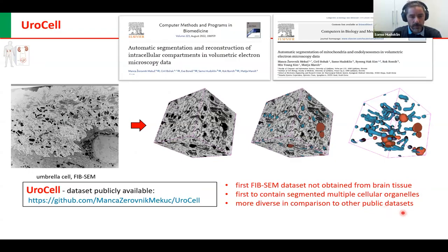Lots of those publicly available data sets actually are done on cell lines or simple cells from cultures, while our data set is based on actually fully mature cells from animals.